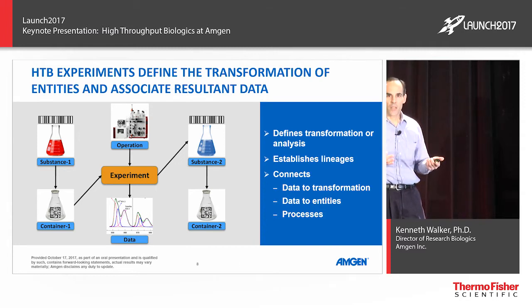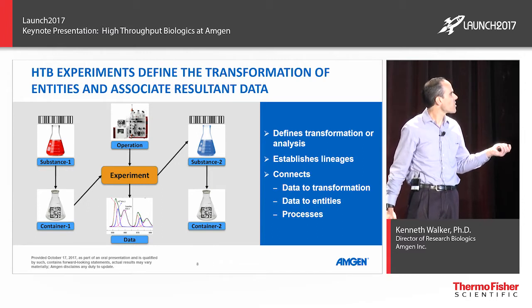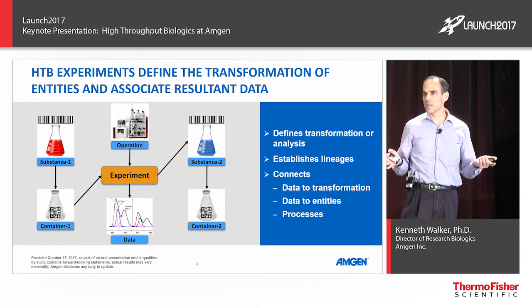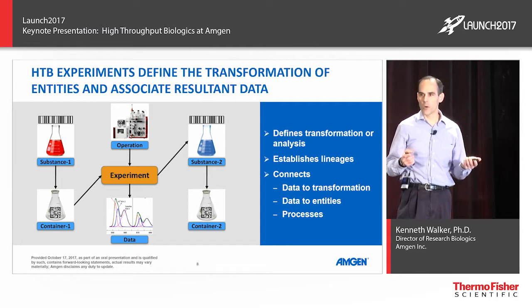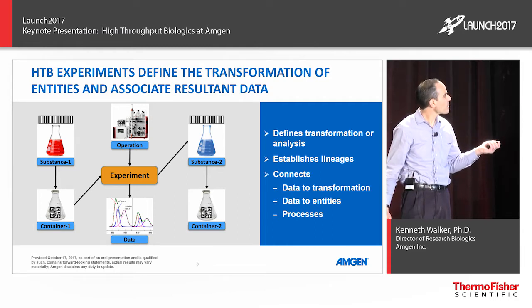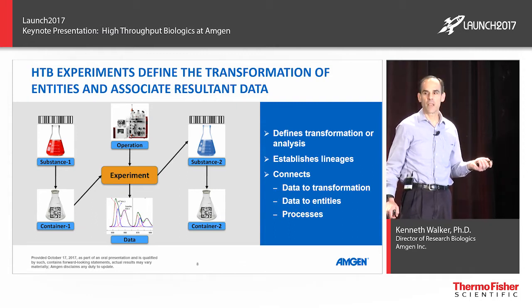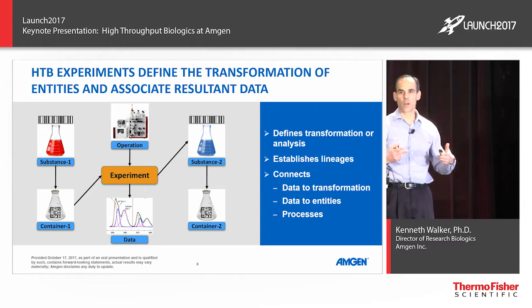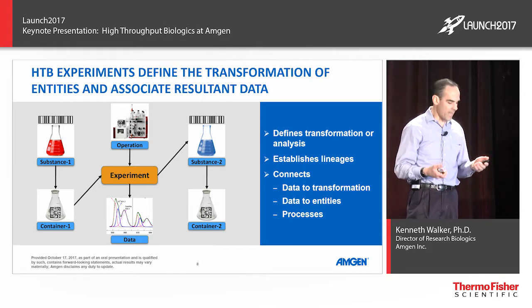They carry out the operation, they collect the data, and then the data is tied back in to that sample and that operation via the experiment. Now, for an analytical type experiment, that might be the end. You would just do this part here. But if you're actually doing a transformative type of experiment and you're converting the substance into something else, you'll end up with substance 2 over here. And so what this experiment does is it ties substance 1 to substance 2, tells you exactly what you did to it, and it also ties in the data that was generated during that transformation. And so that's why these experiments are very critical for us to make sure that we know exactly what's happening. So they track lineage as well as what has actually happened to that sample.